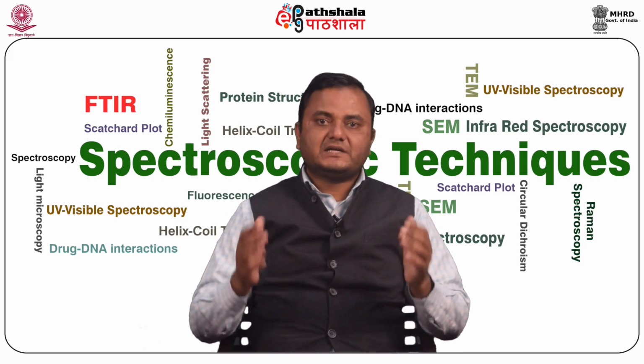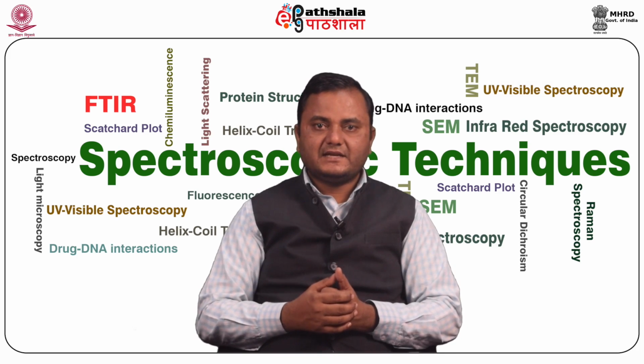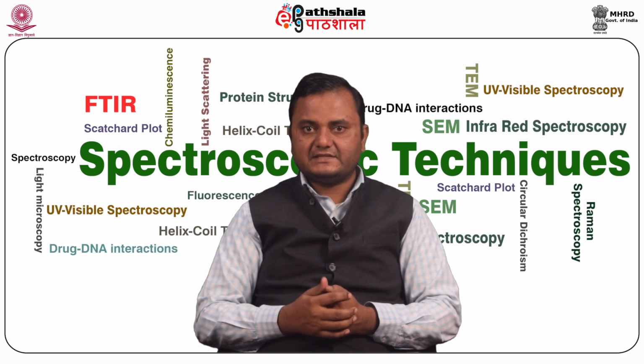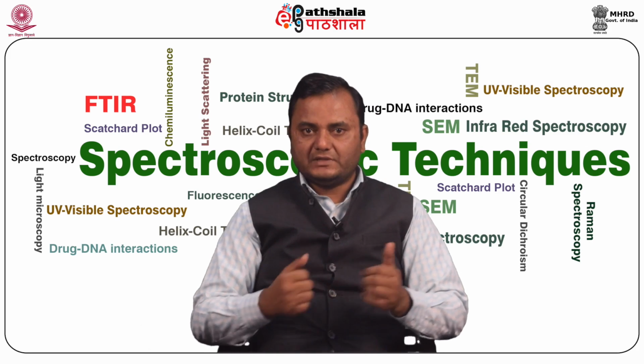The continuous Fourier transform, used on continuous signals, is defined by this relation as a function of x, with e to the power of minus 2 pi i w x.